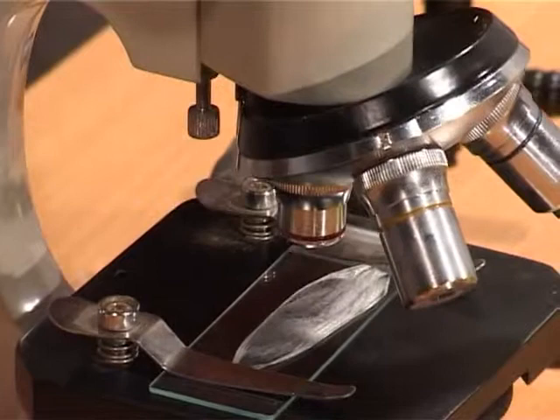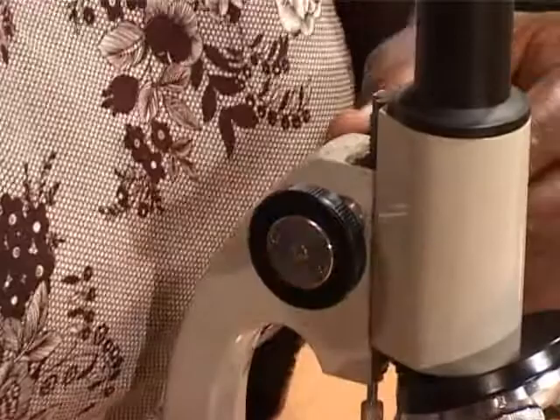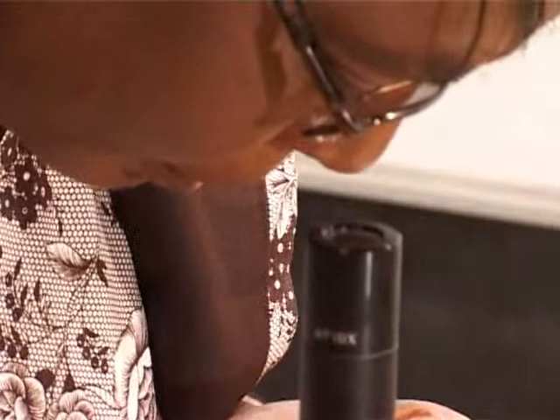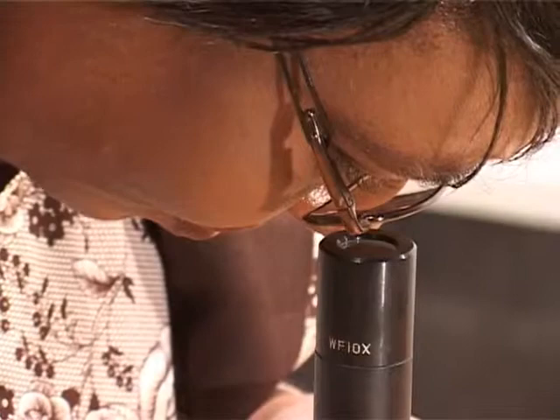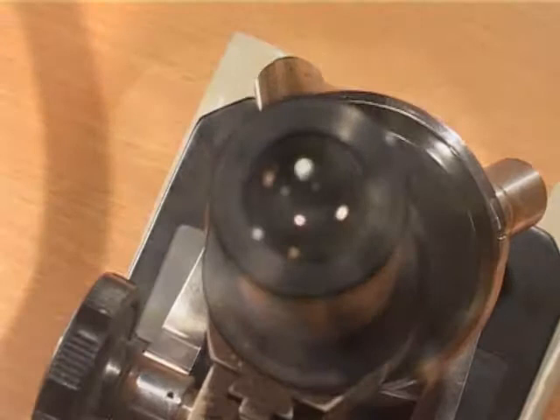Okay. So let us, learners, continue. If you have not seen properly, you turn it. Okay. Let us continue, see through. You keep on adjusting until you see clearly. There we go. We've seen how plant cells look under the microscope.